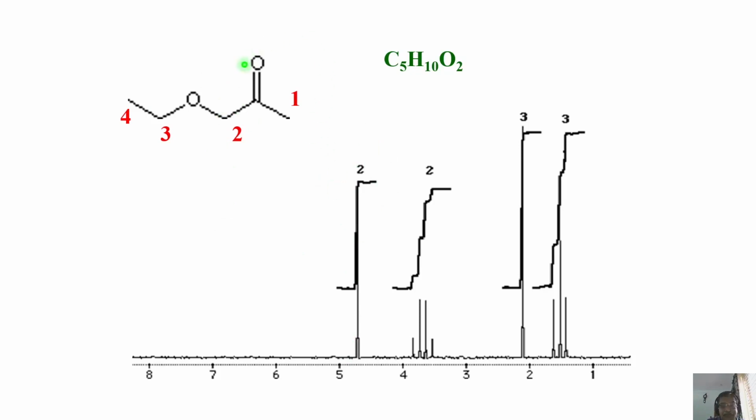As I said in the previous case, there is an OCH3 group. It is not just OCH3, a C double bond O CH3 is there. This CH3 is not coupled to anything and remains a singlet of intensity 3. Very clear, right? So analysis becomes very simple.